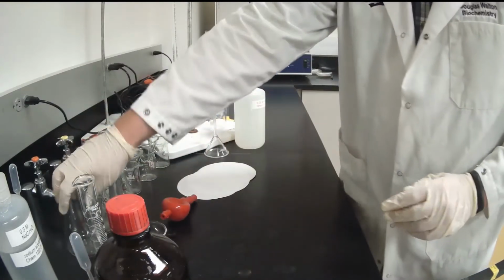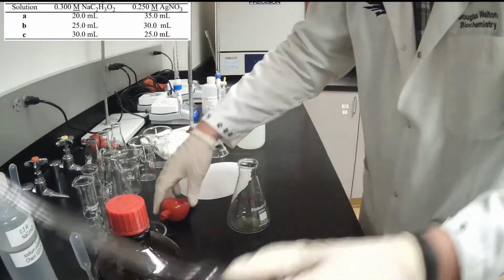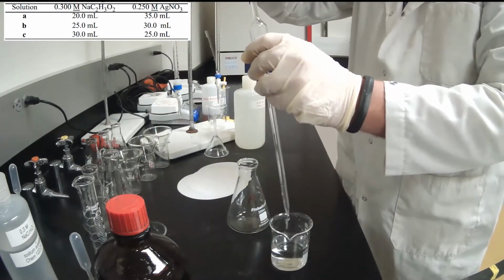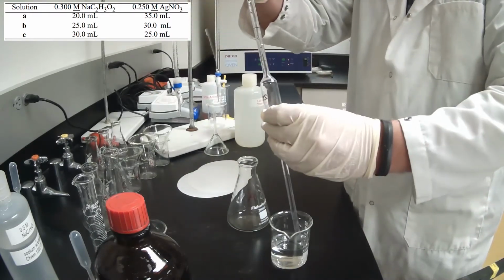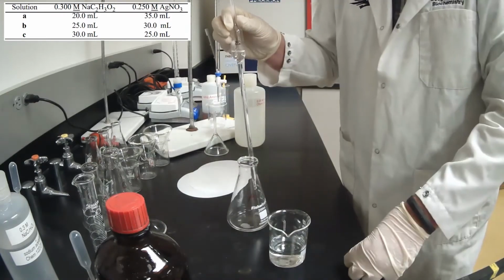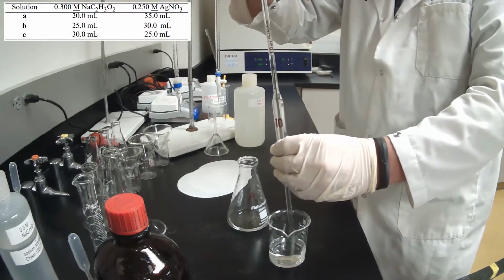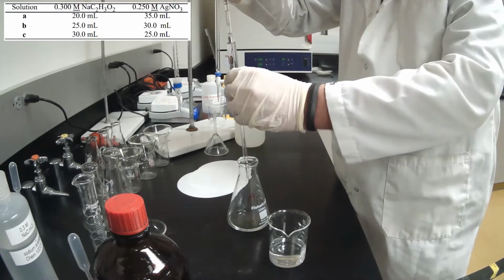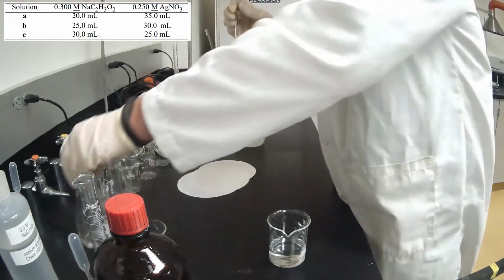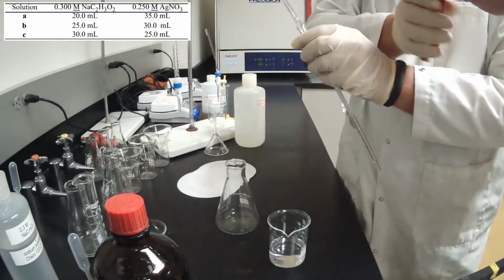Right? So into the first Erlenmeyer flask, we are going to take our pipettes, and I need 35 total. Oops. And I'll be doing 30. So that's 35 silver nitrate in there. Now I need 30 into the next one.